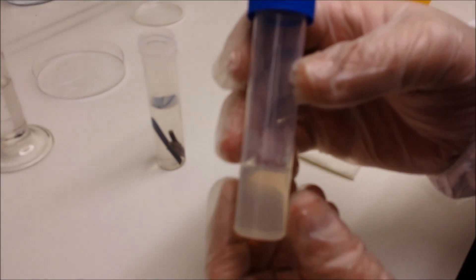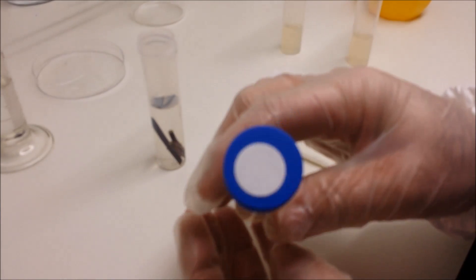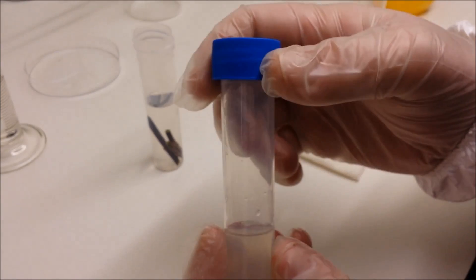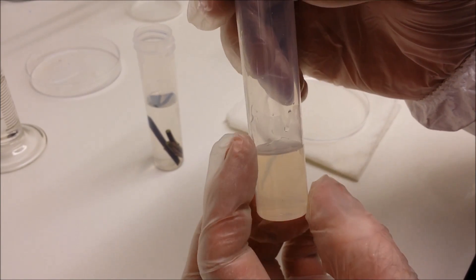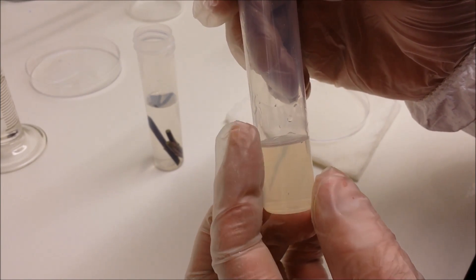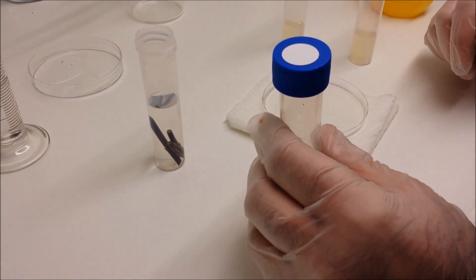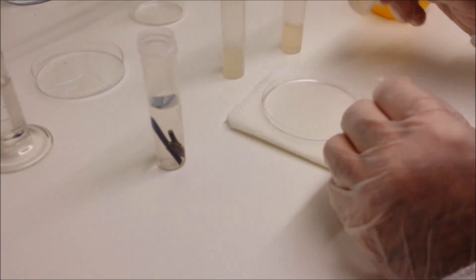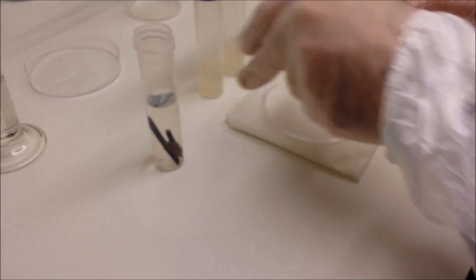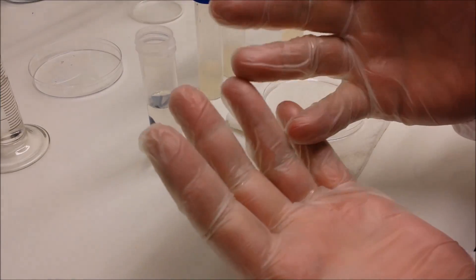Available in three different types. This particular one is fitted with a 0.2 micron filter to keep out bacteria and other contaminants but allowing oxygen in for the growing plants. It's also available for seed sowing purposes, which is another flask.